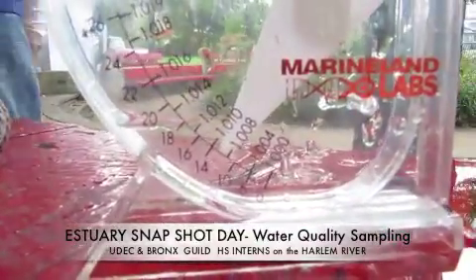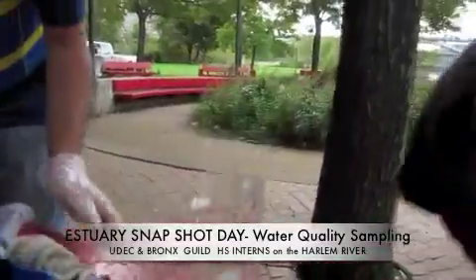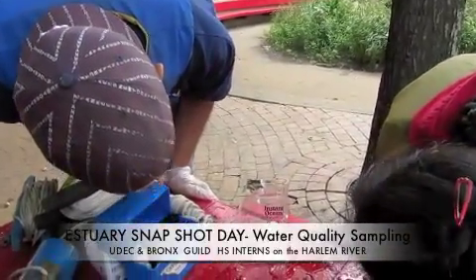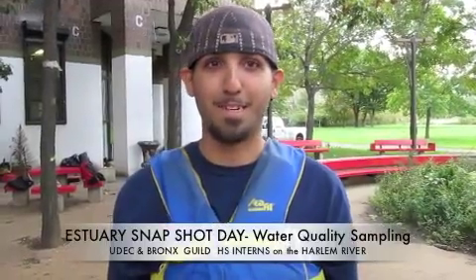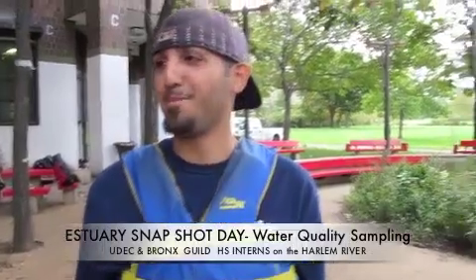Is the needle steady? What's our reading? Our reading is between 10 and 14, so I'm going to say 12. Our reading is 12, compared to 32 to 38, which is the salinity level of the ocean.